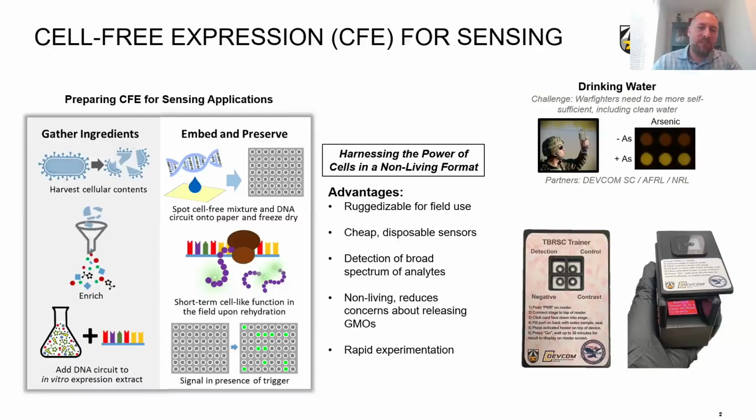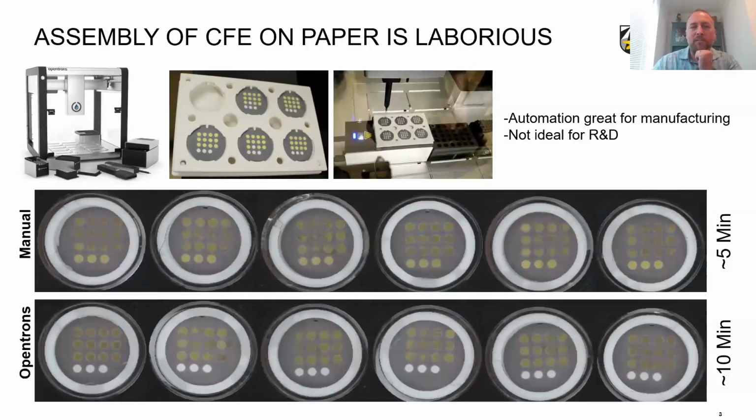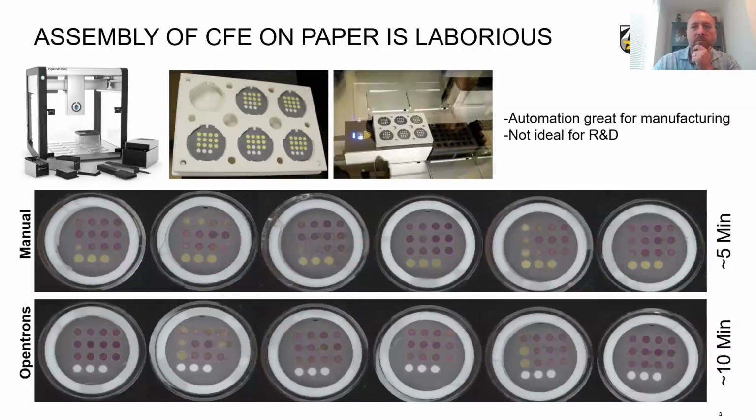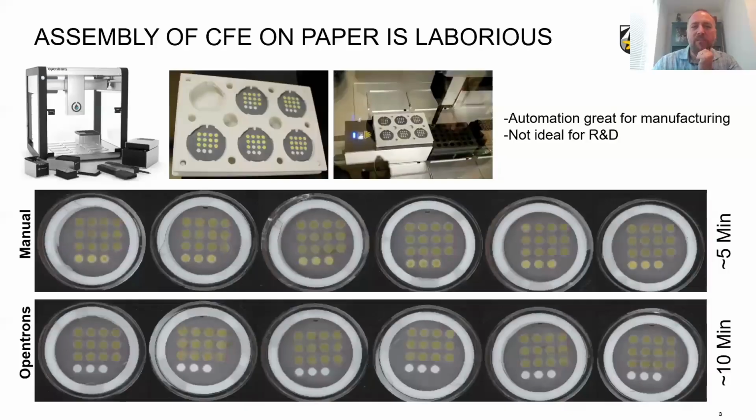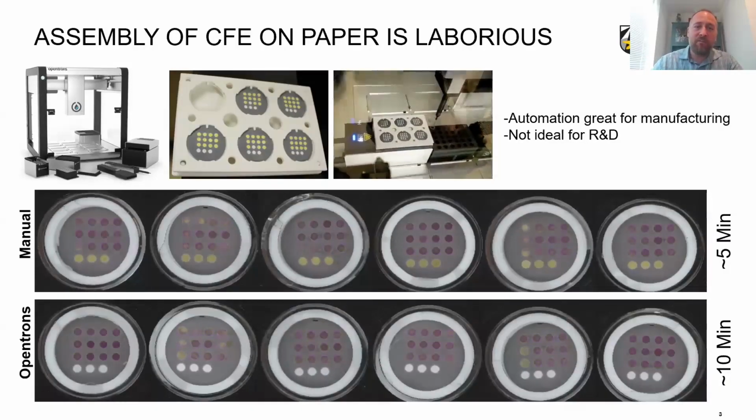There's a number of advantages to doing this, but the one I want to highlight and talk about most today is rapid experimentation. High throughput experimentation usually uses robotics, and using typical robotics, we can scale up the production of these things quite well. I'll mention as an aside, we used JMP software to do a DOE for the robotics parameters for the instrument shown in the video above.